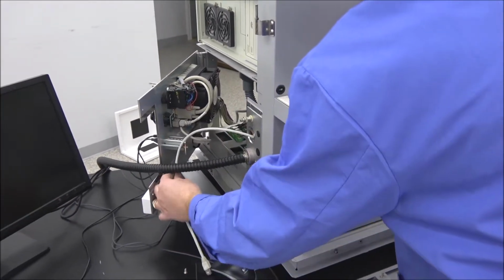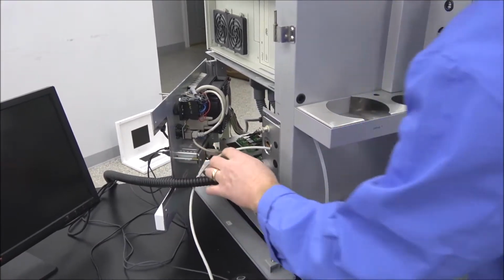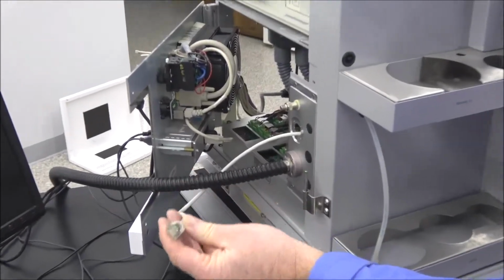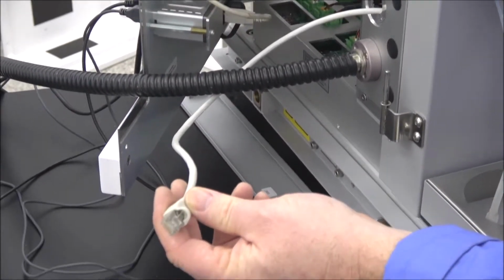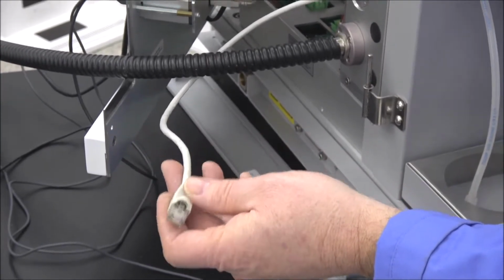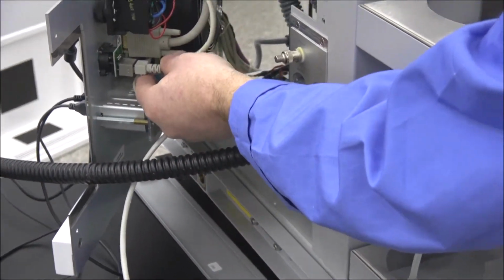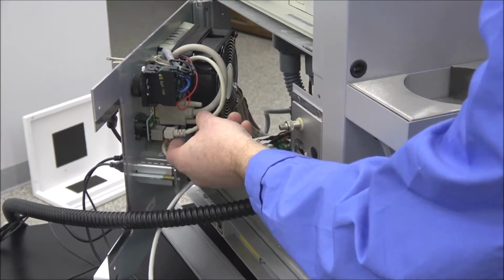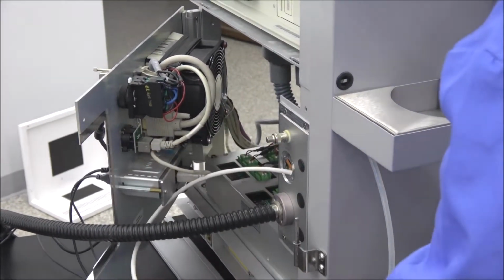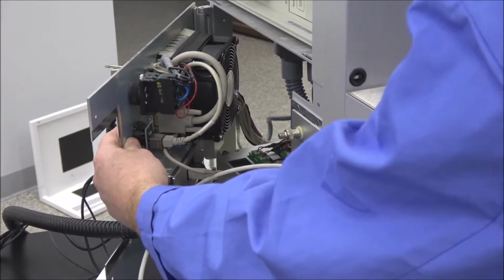And while we got this door open right here, there is a possibility, if I remember right, this is actually the UV light source that needs to connect down to turn the light source on and off. And I believe what I did is, because this is your internet access line, I actually just unplugged this, and I plugged this into the internet access line so that you can just plug the UV light source into that.